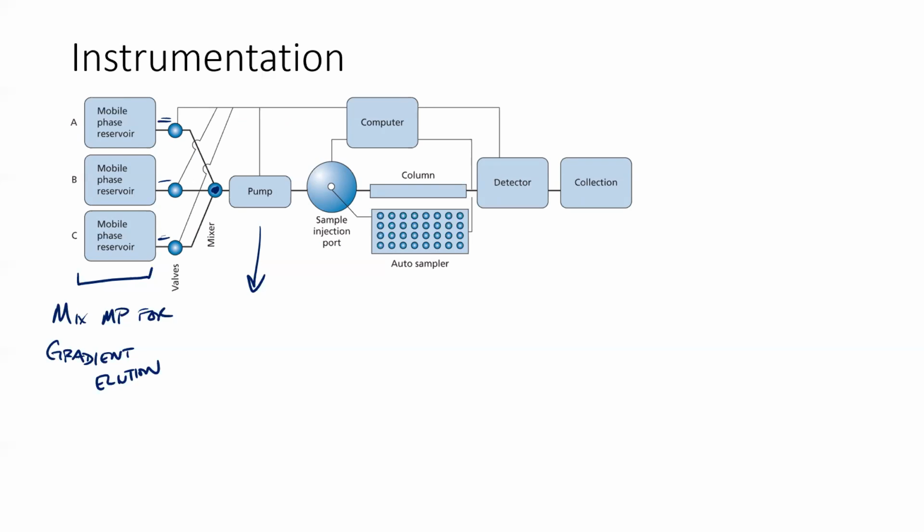You can imagine that if that were really how things worked, pull it from a reservoir and push it into the instrument, you'd have these pressure spikes every time it was pushing into the instrument, and these pressure dips when it was pulling from the reservoir. So if you have one pump, your pressure versus time curve would look something like this.